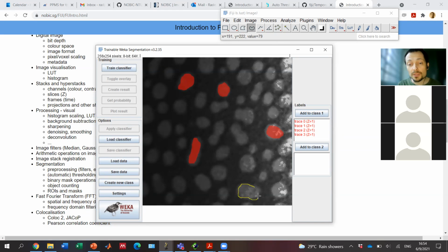Of course, if I wanted to segment only a single image, I wouldn't take the effort to train the classifier. I would rather segment it manually if I cannot do it in any better way. This all makes sense if I want to do an automated procedure and segment thousands of images. So then I take the effort and train the classifier.